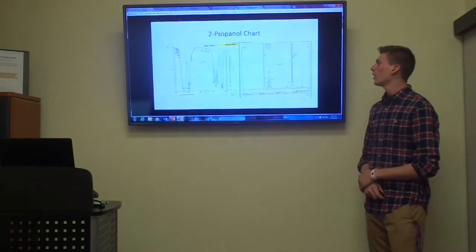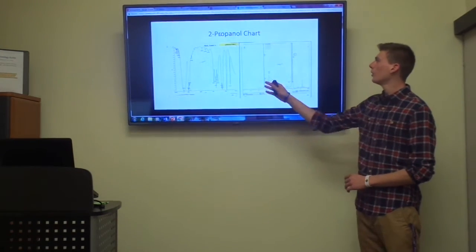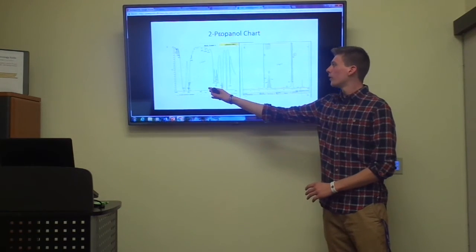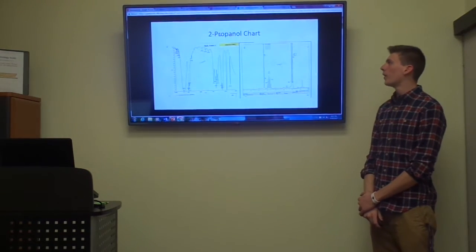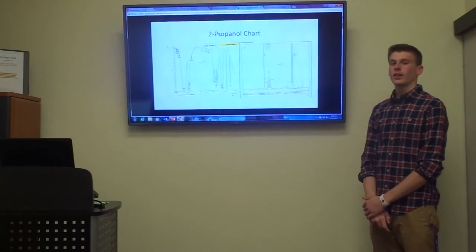Here are the charts I used. On the right is the NMR. It shows a 6:1:1 ratio, and on the left, the IR. By using the data at the bottom of the peaks, I was able to find the functional groups just like using the chart at the beginning.